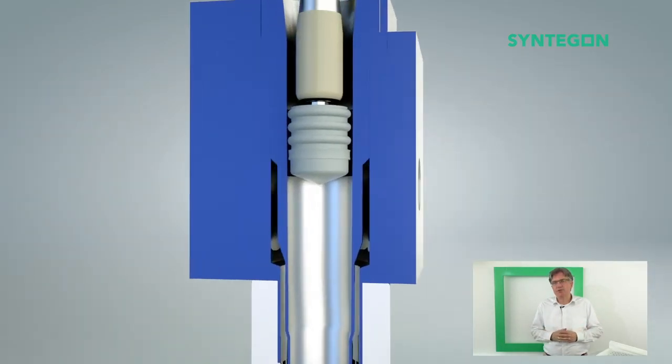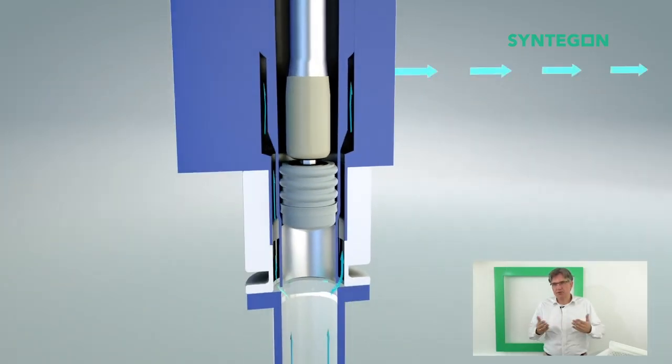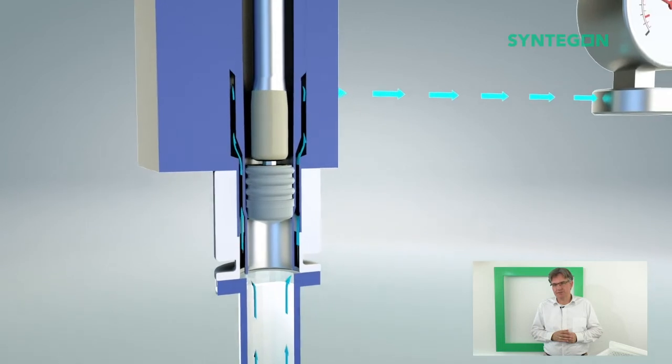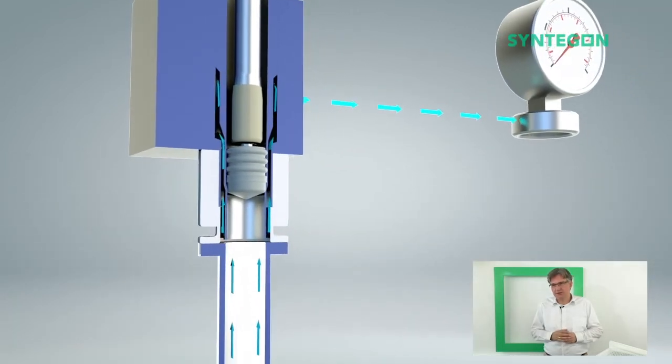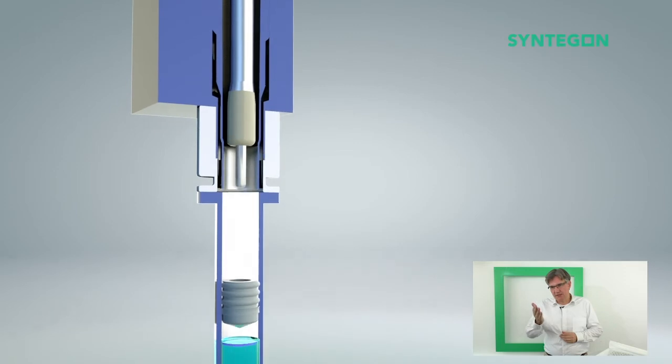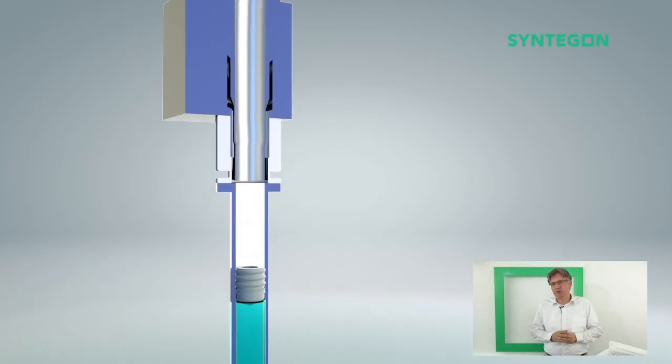And due to the vacuum, the stopper will go down on the fill level. Here you see the vacuum and how the stopper is going down on the fill level.